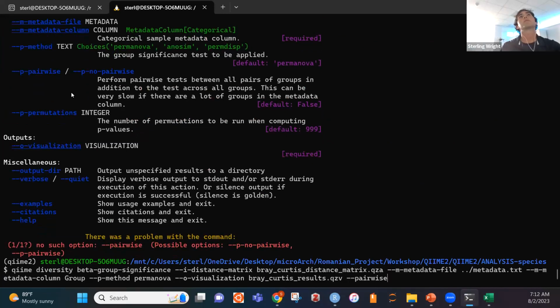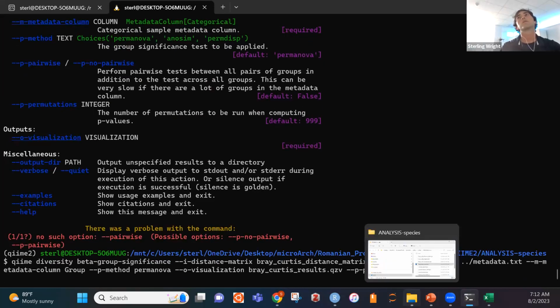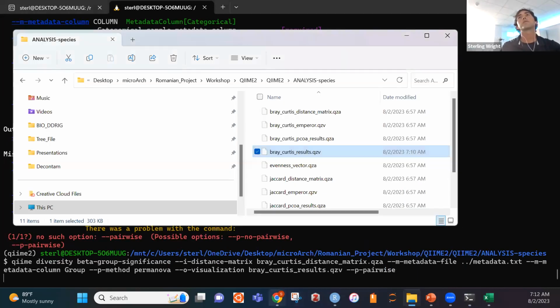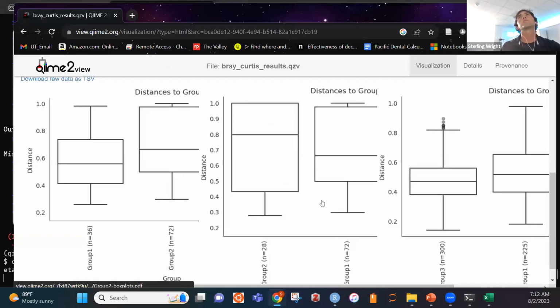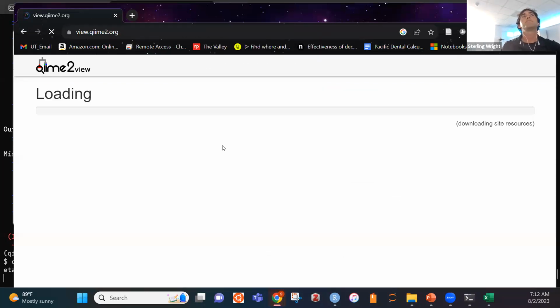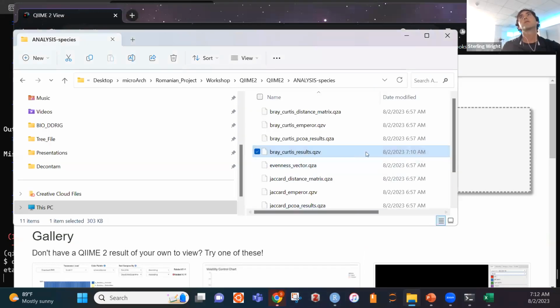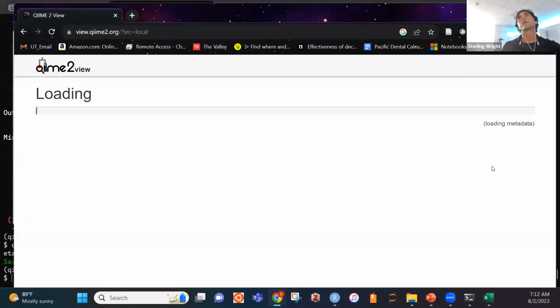Sorry. So overall, this is telling me there are overall distances between groups, but if I rerun that command, now upload it again.